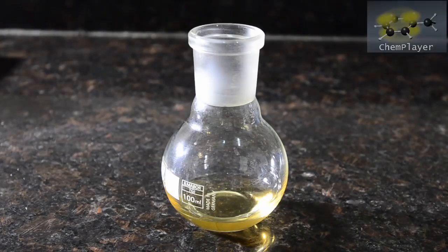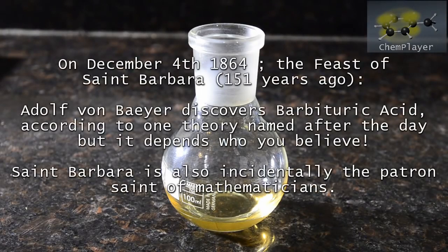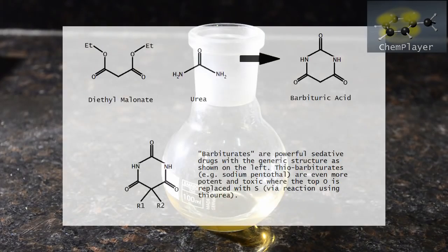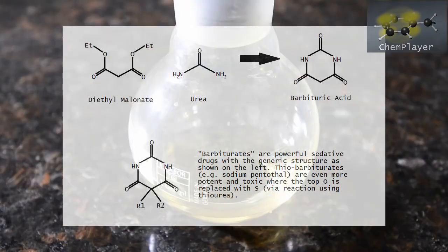Today is the 4th of December, the feast of Saint Barbara. 151 years ago on this day Adolf von Baeyer discovered how to synthesize barbituric acid, the parent molecule for barbituric sedatives, all named after Saint Barbara. So in honor of the German chemist and to commemorate the day, we're going to synthesize barbituric acid using the diethylmalonate we prepared in the previous video.